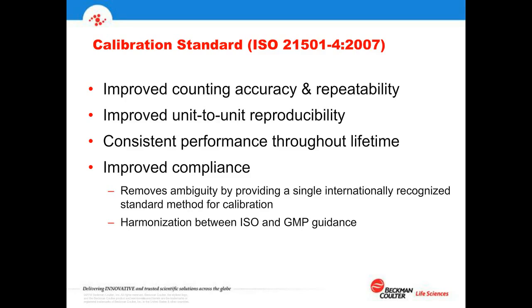So also, I can mention briefly that 14644-2, the companion document, was also revised, and it's focused on monitoring. So -1 focuses on classification, -2 focused on monitoring. I'm going to touch on that very briefly here, just because, again, it does relate to our discussion today. And this is not, again, a prescriptive or formula-based document in -2. Monitoring occurs in 1,000 different ways in all the various industries, so it's impossible to really put together a standard that describes a method.